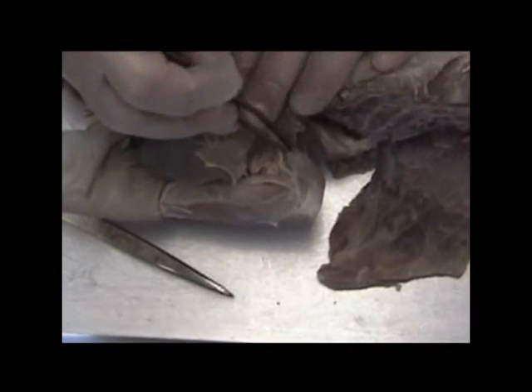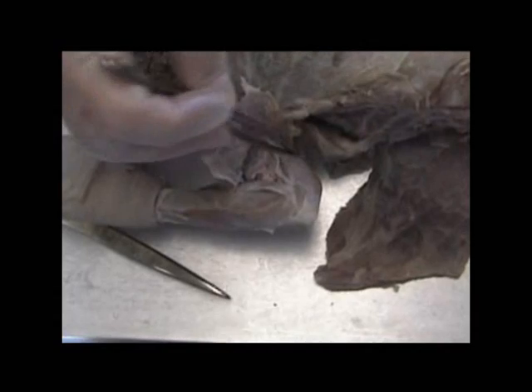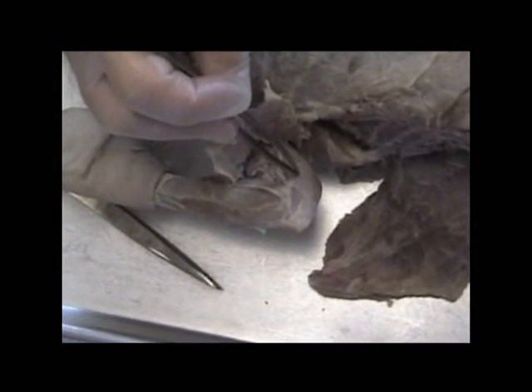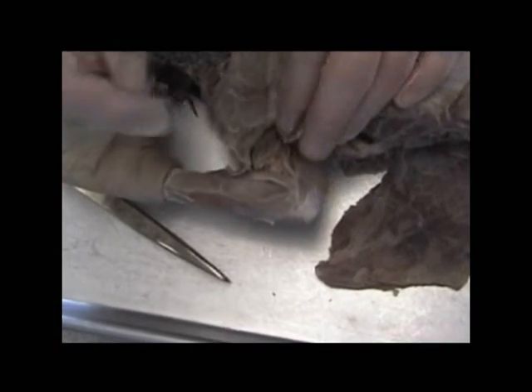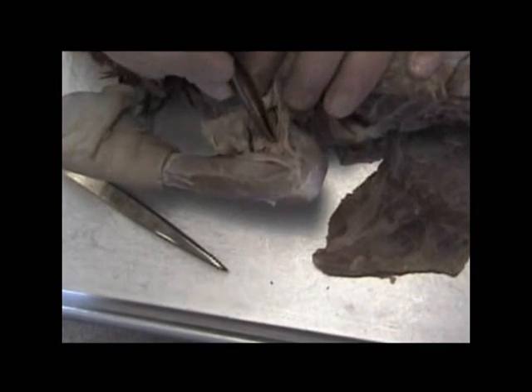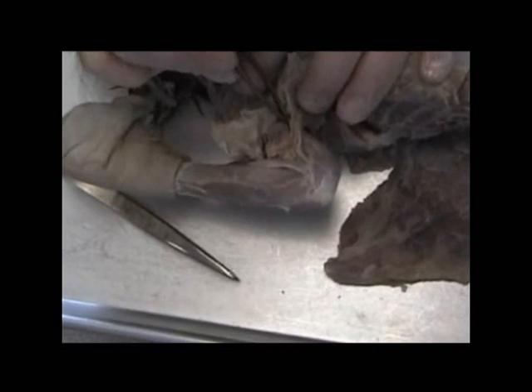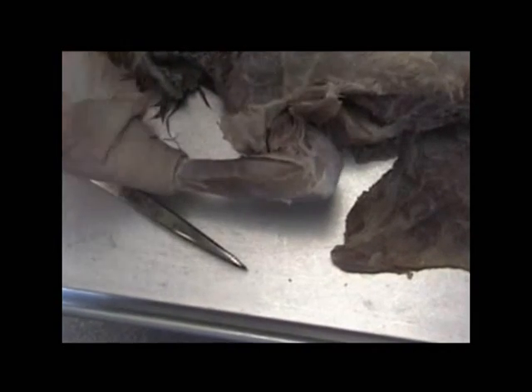This muscle, which actually runs this way, if we pick that up and look underneath that, we see a variety of muscles. One muscle right here, which is running along the bottom of the foreleg, and we'll see the same muscle from the other side, and this is part of the triceps, and I'll come back to that in just a second. Underneath the pectoantebrachialis, running across, if we pull that back, we find this rather significant muscle right here, which is the biceps brachii.